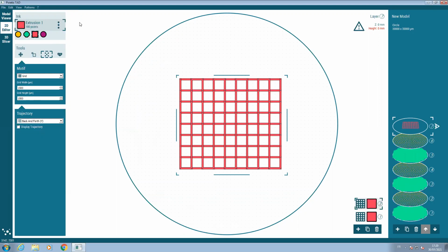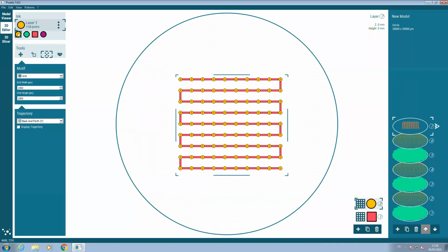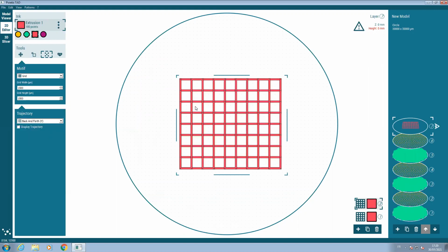And one application that you can do is to create this grid with a material and then with ViewPrint go and print cells inside. So this is during an experiment if you want to visualize and do it, or directly do it from this CAD and say, okay, I will create this grid, and then with the laser I will print, I will print cells inside these grids.